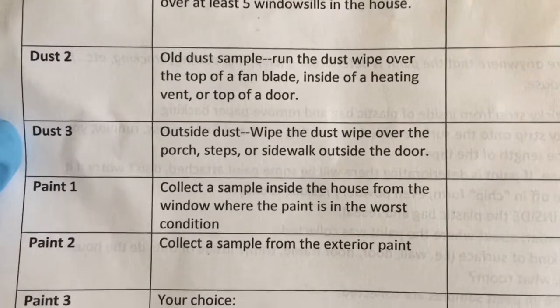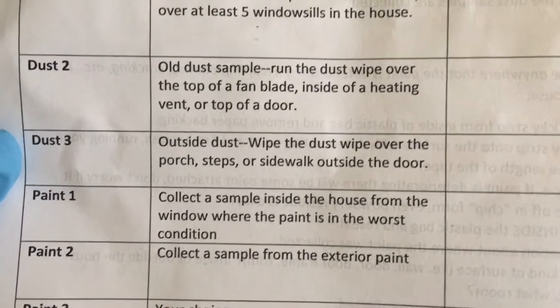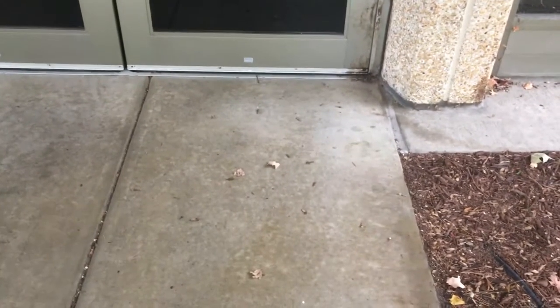For Dust Sample 3, we will be collecting a dust sample outside the house on either the porch, steps, or the sidewalk. For example, the sidewalk outside the store is a great place to collect our sample.